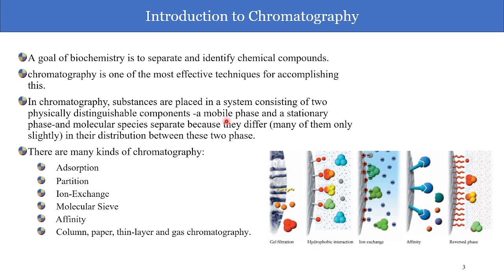There are many types of chromatography. I have mentioned only a few over here, but the major ones being adsorption chromatography, partition chromatography, ion exchange, gel filtration chromatography, thin layer, gas chromatography, and affinity chromatography. All of these chromatographic techniques need not be used for the separation of one particular mixture. Rather, you need to understand which chromatographic technique you want to use that will be able to separate out only your desired product, or desired molecule.